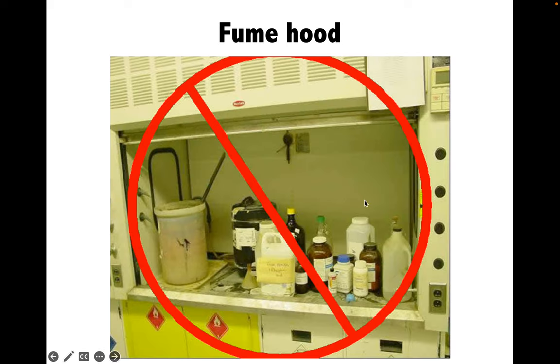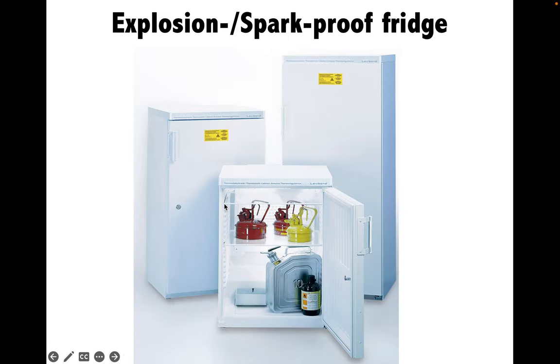The fume hood is not the place to store chemicals or equipment — the space must always be kept clean and free. The fridge is another piece of equipment that many people neglect. Storing flammable chemicals like pentane, benzene and xylene is not allowed in a non-spark-proof fridge. A spark-proof or explosion-proof fridge is required for those chemicals instead.